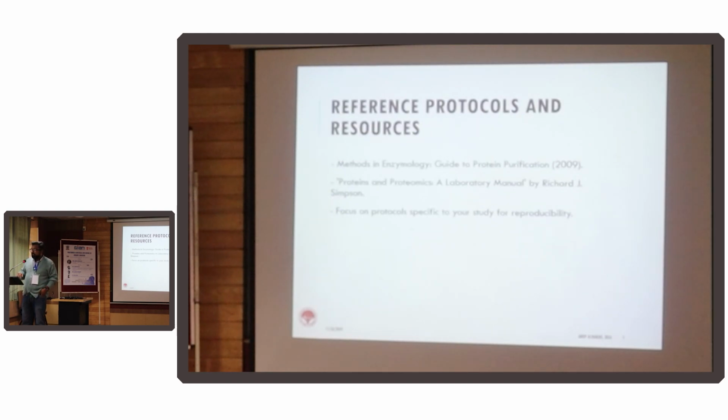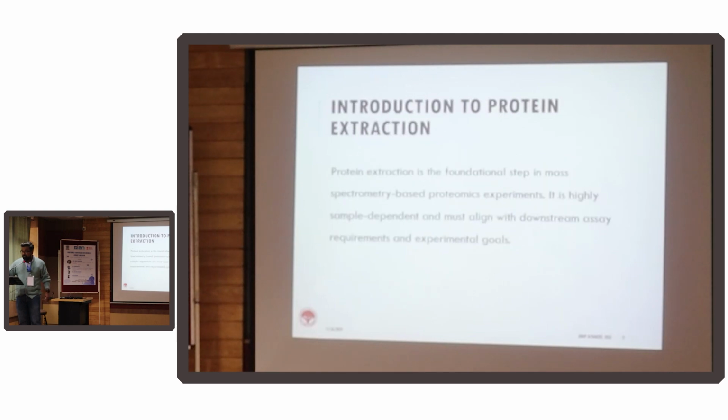And of course, there are always a few studies that some people have done earlier. So if you're having any protocol, you want to do proteomics of tomatoes, look up on PubMed, look up on Google Scholar, get in touch with that scientist if you can, ask them for help. 9 out of 10 people would help you. The good guys do. Else they might have retired or something.